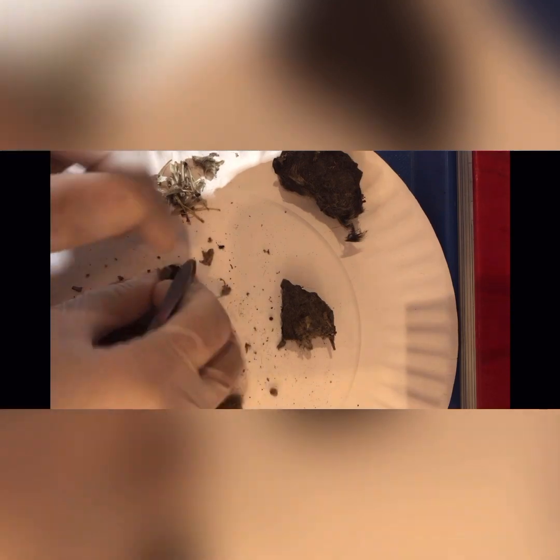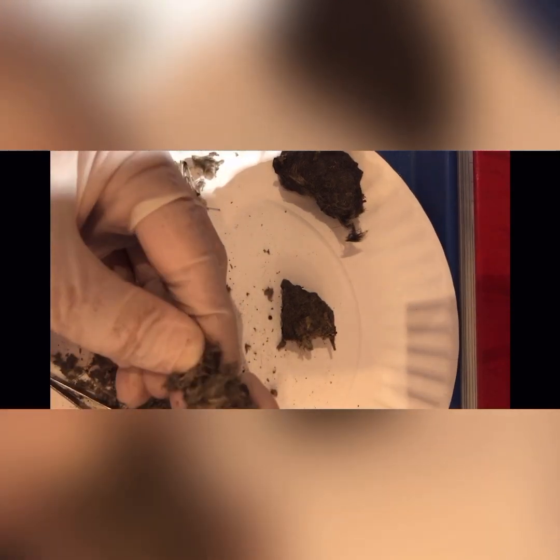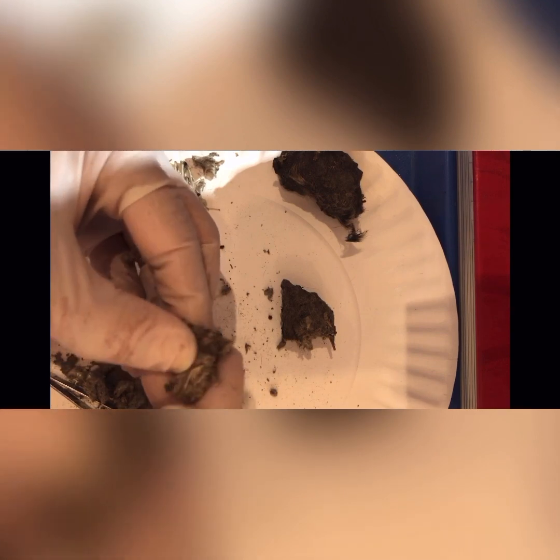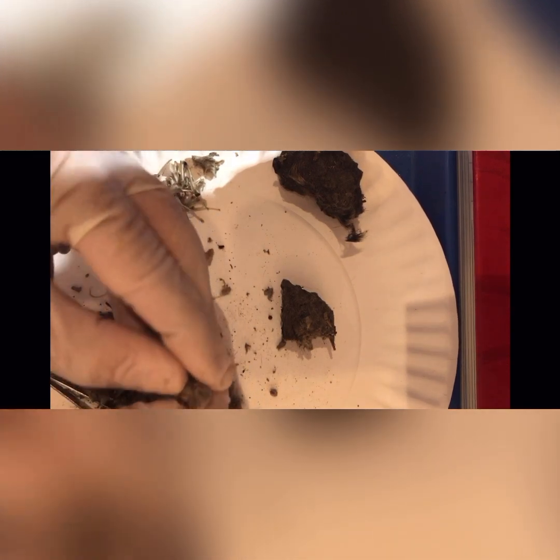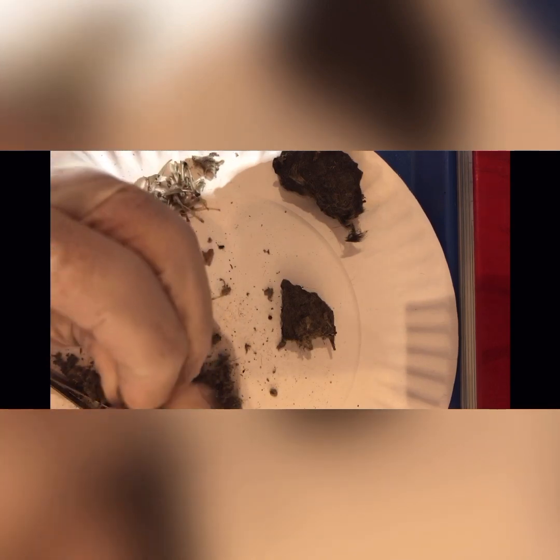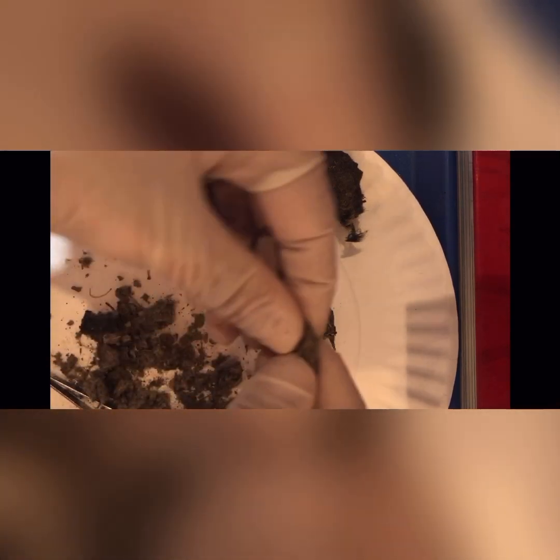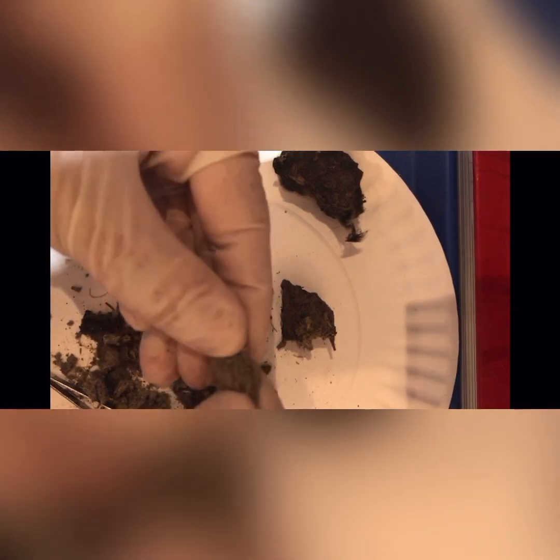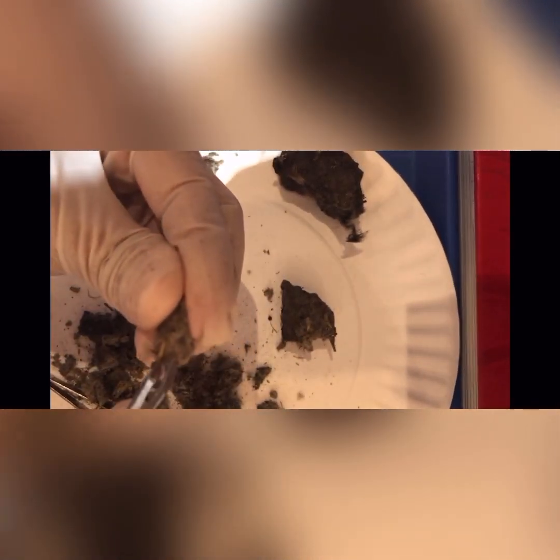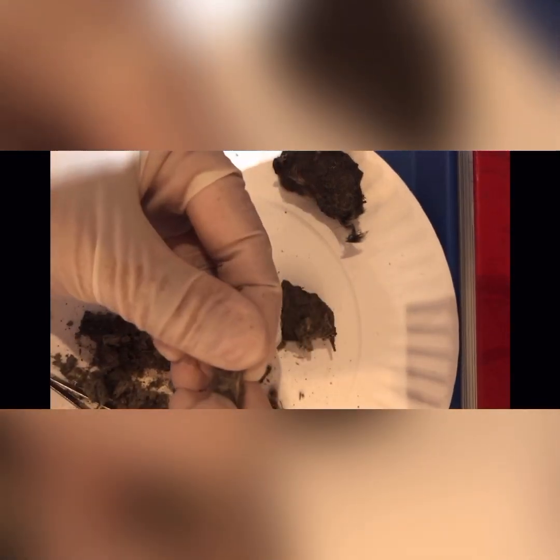Just using my tweezer to figure out. And there are times inside of one owl pellet, you'll find multiple jaws and multiple skulls. And all that means is the owl was hungry. So it had more than one prey, it had more than one animal at its last feed.